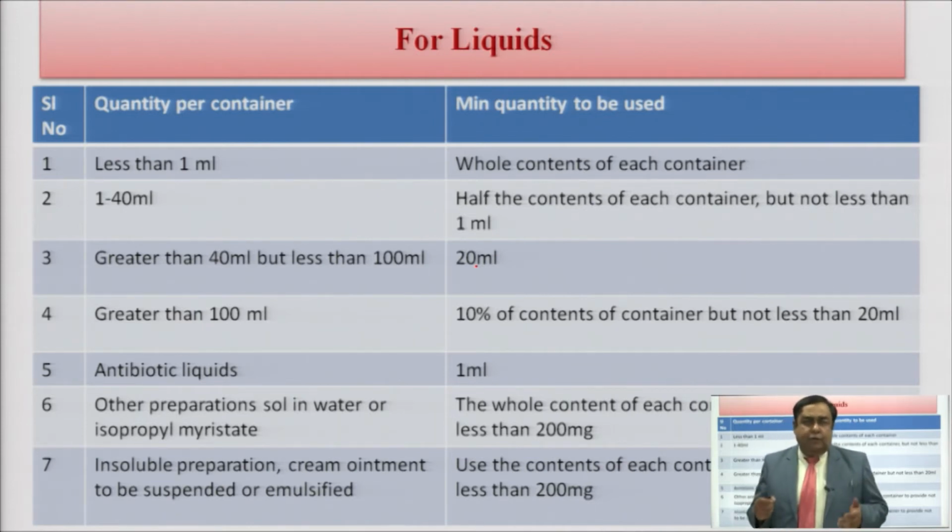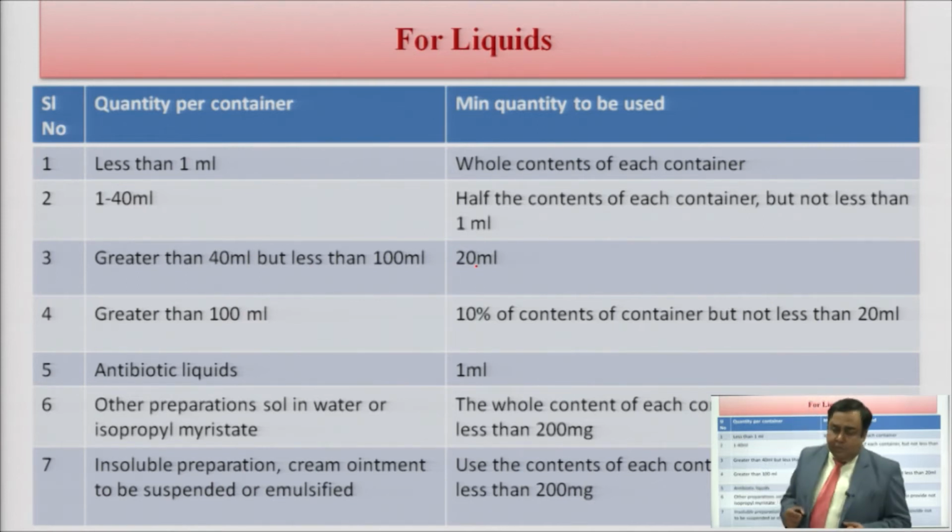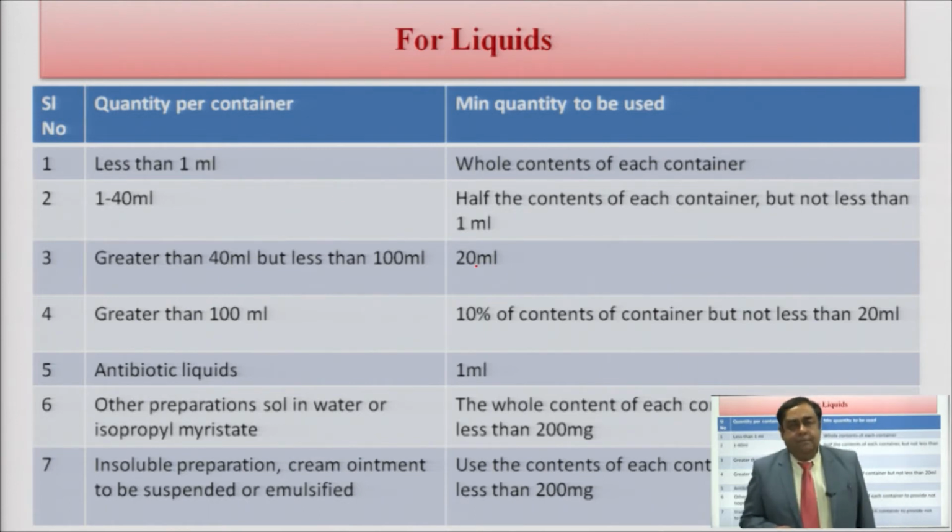If you are going to test various insoluble preparations or creams or ointments, we need to suspend or convert them into a suitable emulsion with the help of an emulsifying agent.